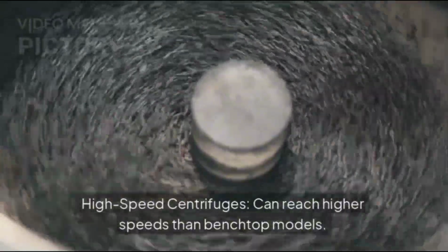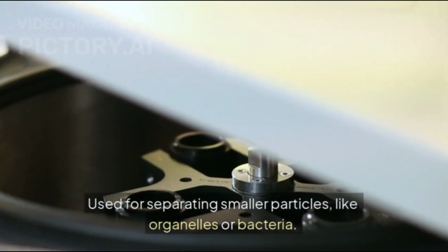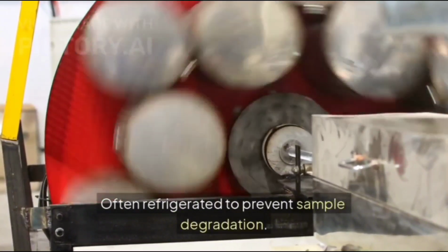High-speed centrifuges can reach higher speeds than benchtop models. Used for separating smaller particles like organelles or bacteria. Often refrigerated to prevent sample degradation.